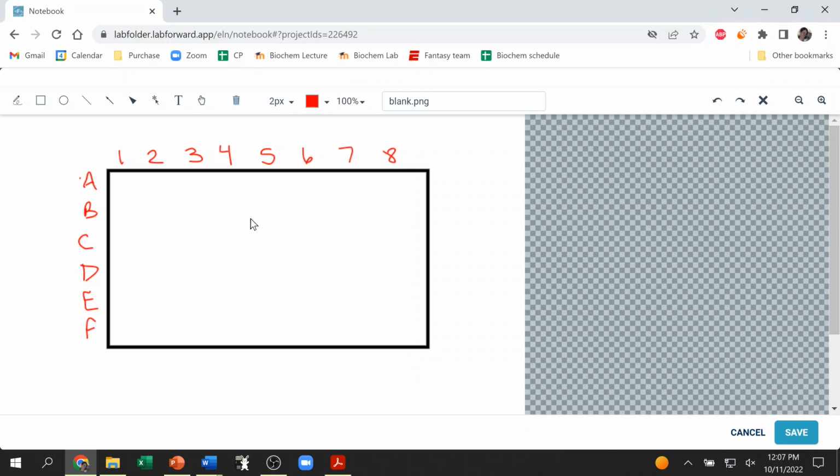This could be really useful depending on the device you're using. You can, again, undo and redo, but once you save it, you can't undo anymore, and it's actually pretty clunky to erase. So I'm using the erase button on my stylus, and it's not working. So you have to actually use the selection tool, select, and delete each individual line. So now that you know that, it's not too bad, but I just didn't want you to get stuck and put a lot of writing on here that you then want to delete.